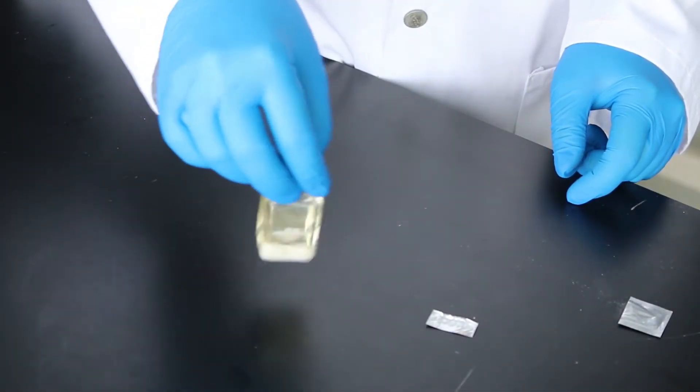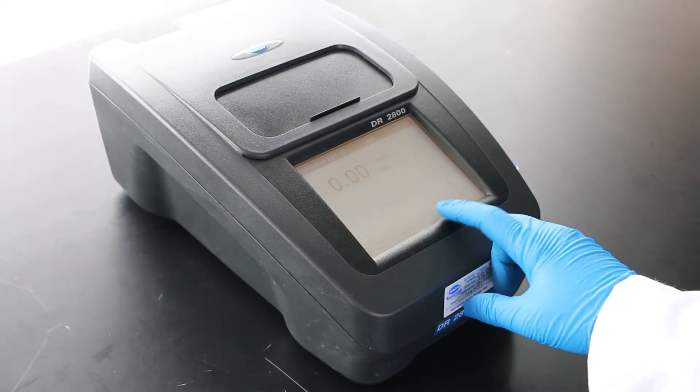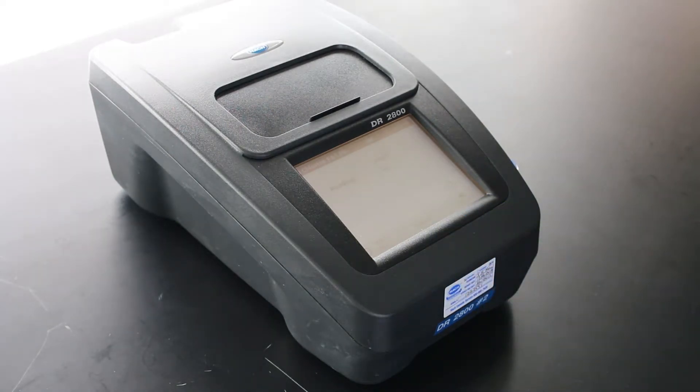If the sample is over range, it must be diluted and the test must be repeated or another method may be available to measure the sample without dilution.